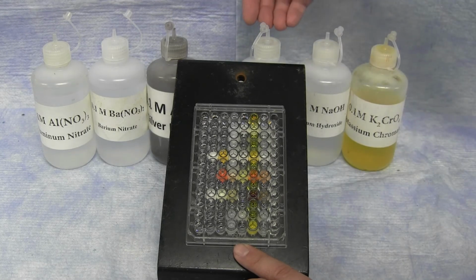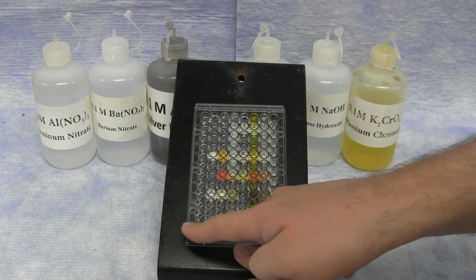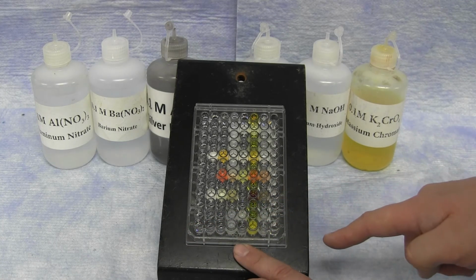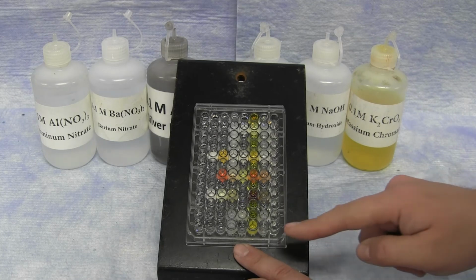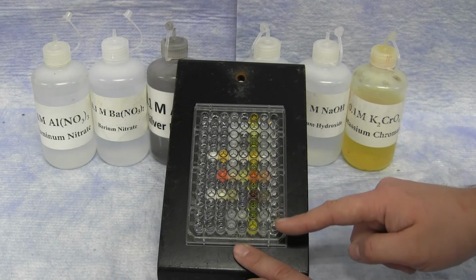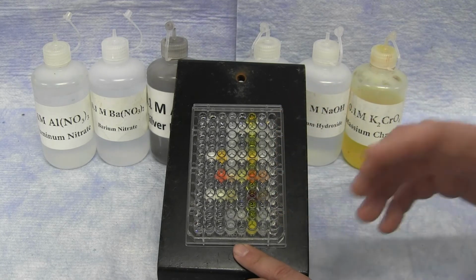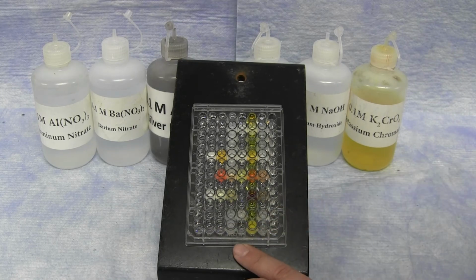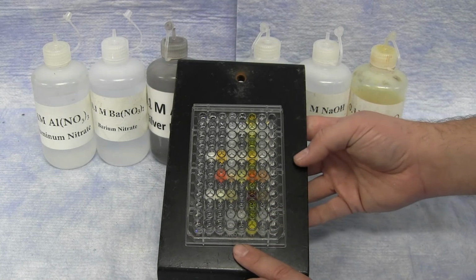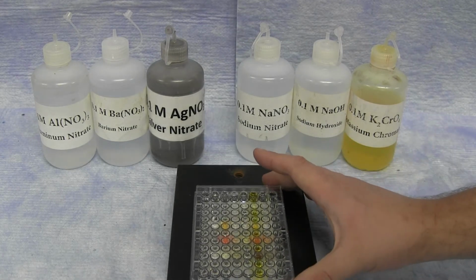You'll react the unknown with all of the precipitating agents in a different row and try to match its pattern. See which of the known metal nitrates has the same pattern as your unknown. And that's how you can determine the identity of the unknown salt.